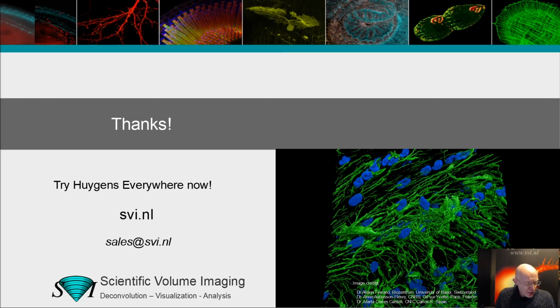I have a license already and I upgrade to Huygens Everywhere. What happens if I stop the maintenance? Well, Everywhere use requires a valid maintenance contract. If the maintenance contract stops, your license will become node-locked again.